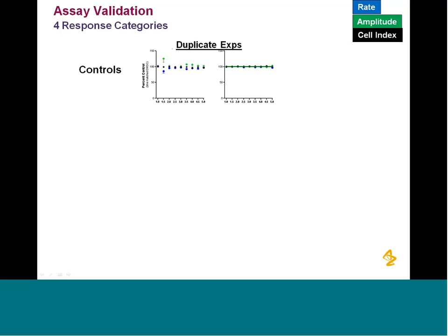Let's see, other background. These are arbitrary units for concentration. I do two half log unit dilutions, and it's arbitrary units because that way I don't have to change the graph every time I do an experiment. I also should point out that every point on this will have one error bar that is standard error. You can't see the error bars, but they are there. And that's from 3 wells on triplicate or replicate plates.